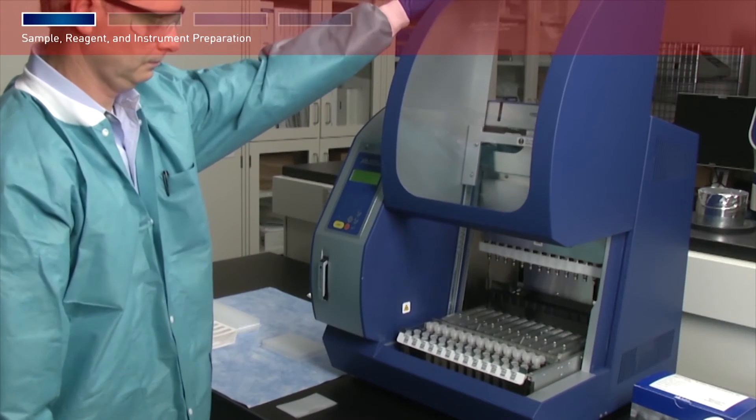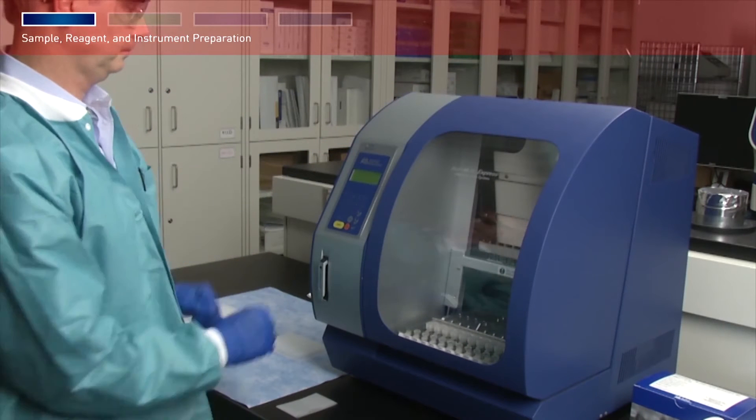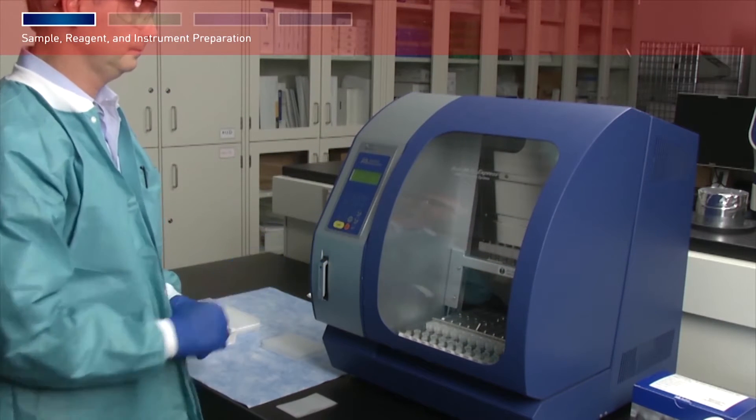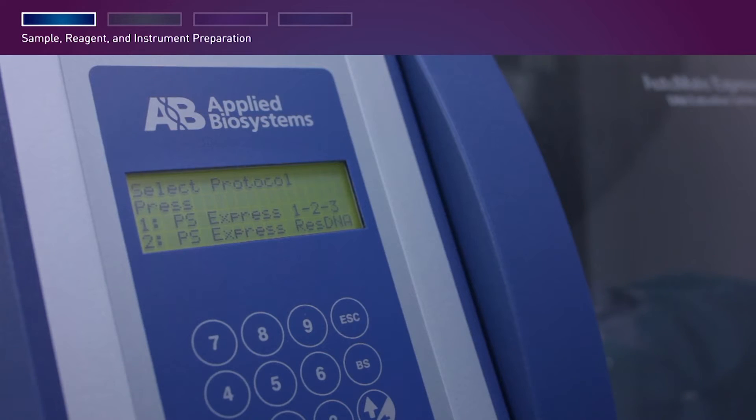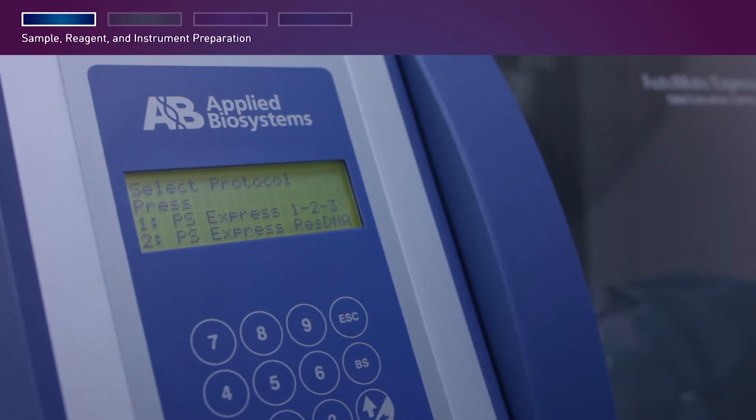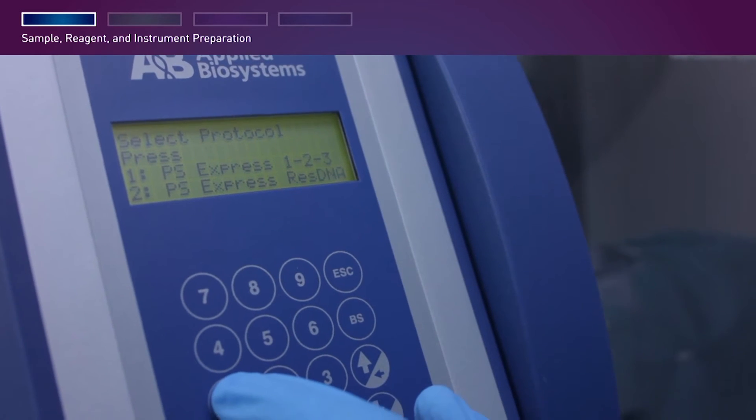Close the instrument door and press Enter. The system will then walk you through the protocol setup. Press 1 to select the PrepSeek 123 option for mycoplasma, MMV, or vesivirus. Press 2 to select the PrepSeek option for residual DNA.